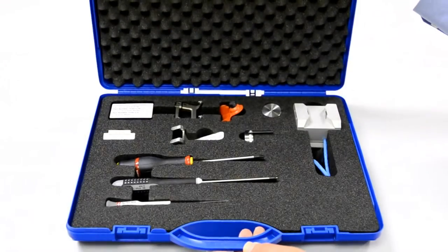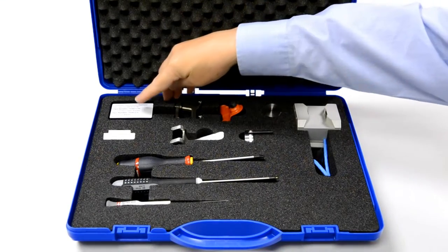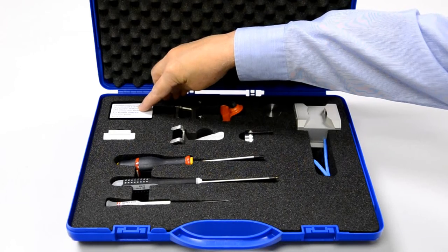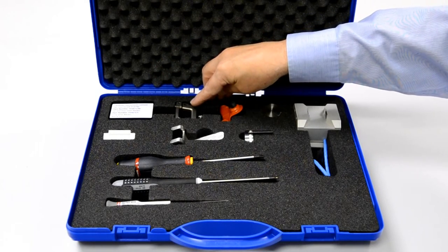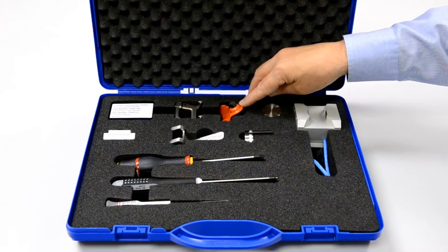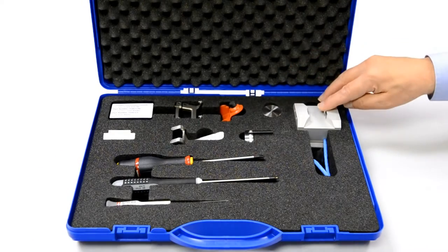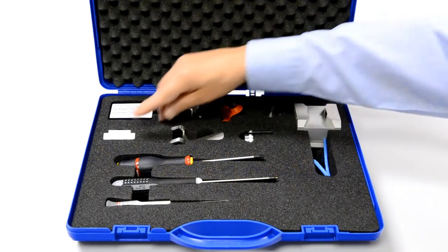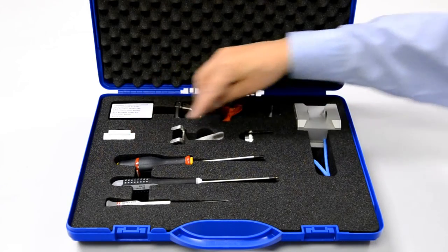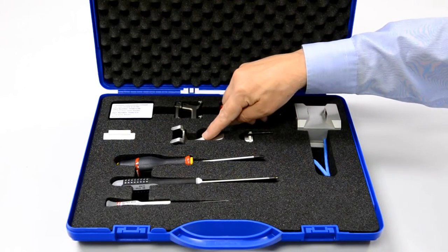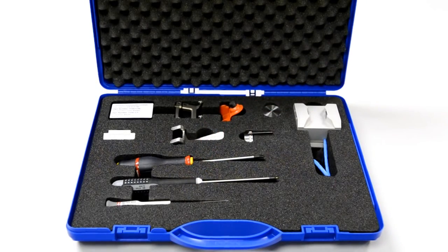The tool case is a convenient place to store items that are required for slicer operation. In the tool case you will find sample ceramic and steel blades, a blade holder with all the necessary screws and washers, a blade guard, an adjustable specimen holder, an optical unit, a blade handling tool, a specimen holder adjusting spanner, and all the necessary hexagonal drivers and a screwdriver.